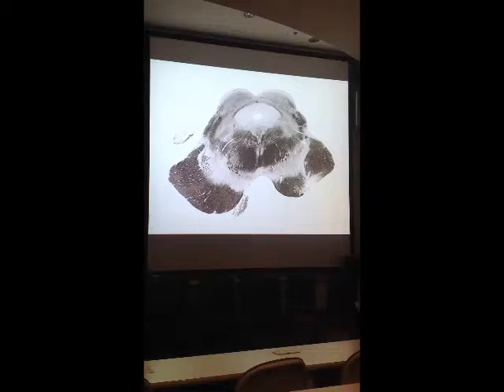You should be able to identify the position of a major nuclear complex here, which is part of the basal ganglia network, called the substantia nigra. Filling much of this area through here is substantia nigra. Certainly, you should by now know that the cranial nerve that exits out of the midbrain through the interpeduncular fossa, which is here, is what cranial nerve? That's the third nerve. So there's the oculomotor nerve.